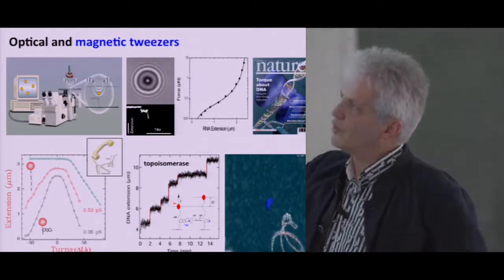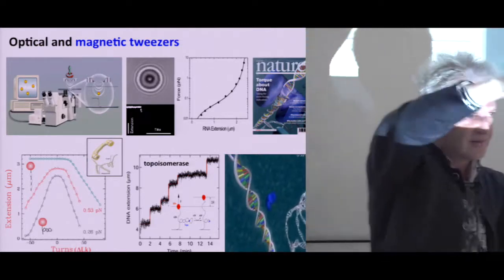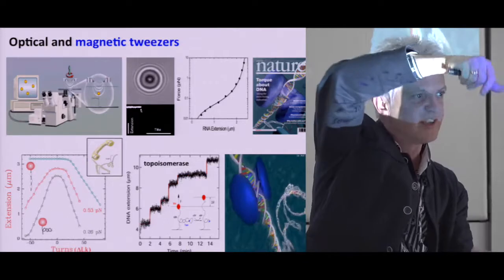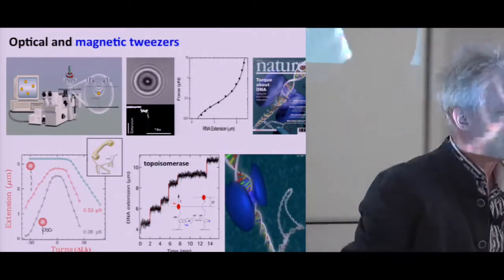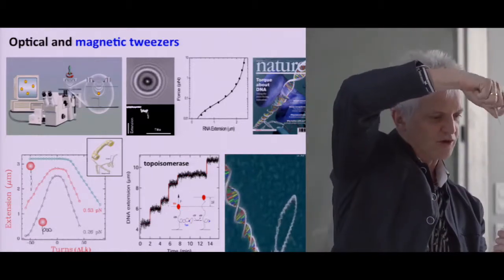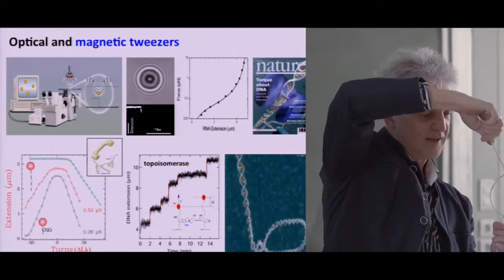The twisting we do by hand, by having this magnet. By the magnet, we manually start rotating, applying torque, to prepare the DNA molecule in a state which has these kinds of coils induced, like that. Okay, get that?